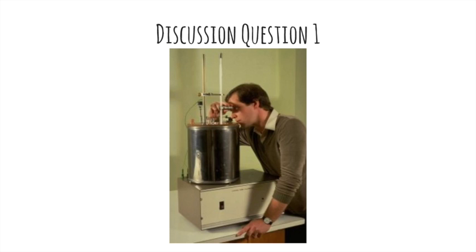Another similarity to a professional is the design of our calorimeter. A huge part of the science industry is designing technology and tools with which to do experiments. Critically thinking about the design of our calorimeter is a great practice for potential careers. The difference between what we did and a professional might have to do with the fact that a real scientist would have more resources at their disposal. For example, they would have a more controlled environment and a bomb calorimeter with much higher efficiency than our soda can calorimeter.